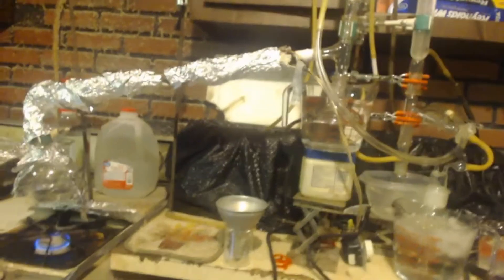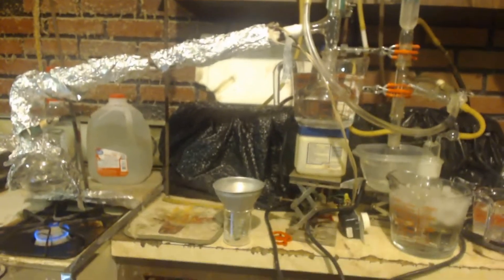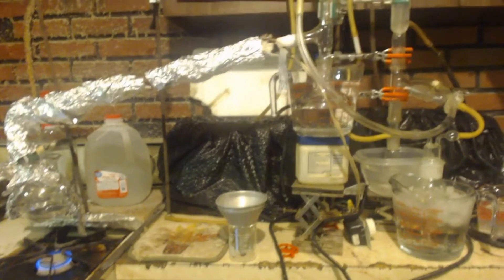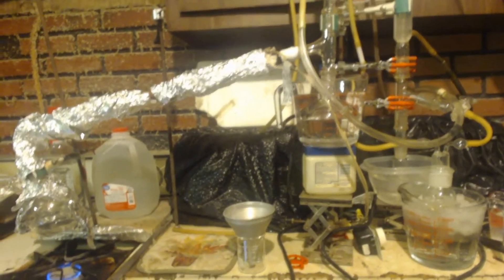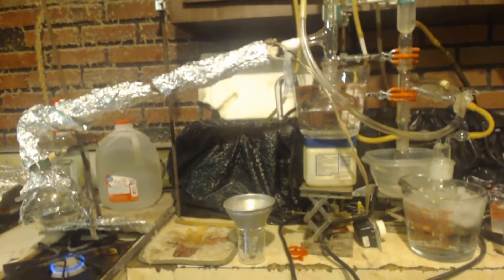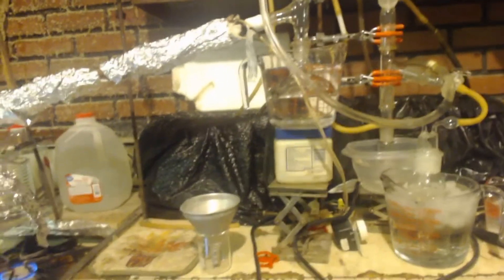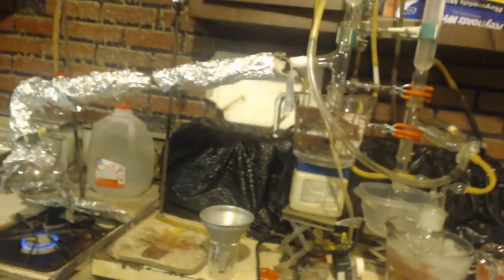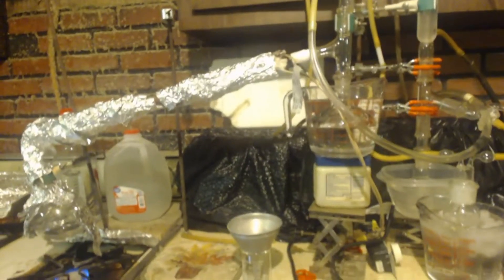This also works with methanol to make formaldehyde — same exact setup. You might want to cool things down more since formaldehyde is a gas. If you wanted to make formalin, you'd take this bubbler with pure water and bubble the formaldehyde into it. They say it's actually easier and a better yield making formaldehyde than acetaldehyde, though I don't know if that's true.